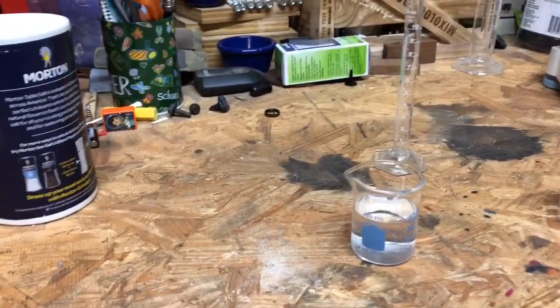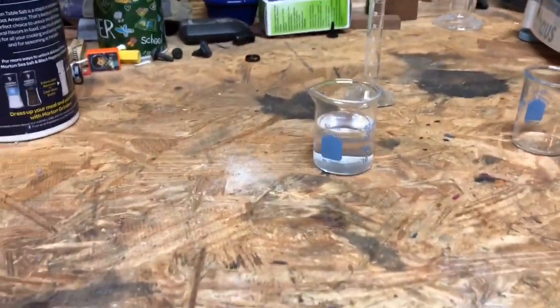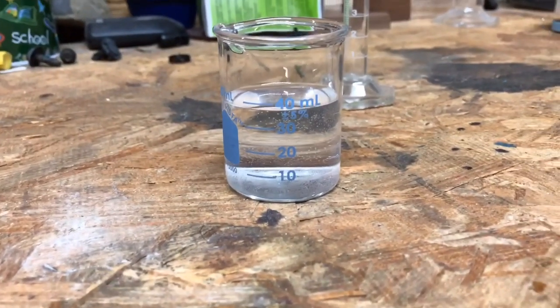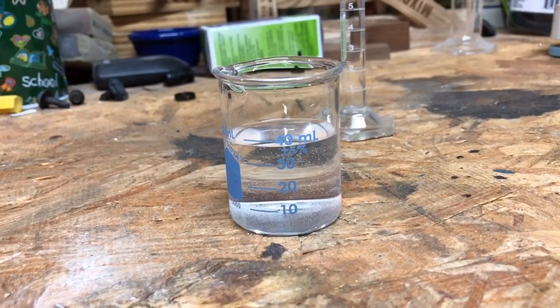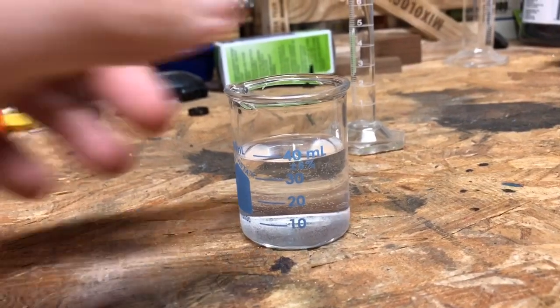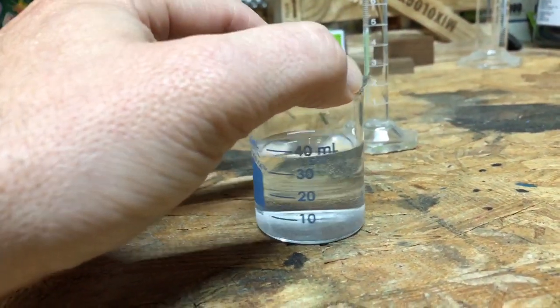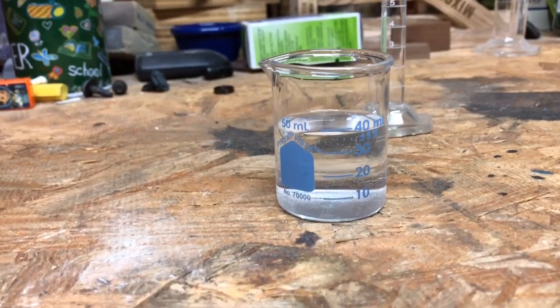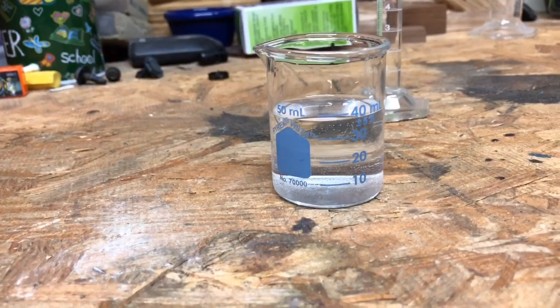And so we know that when we're trying to see how well something dissolves, you have to be working with a saturated solution. What I've done to start is I've taken a beaker, filled with some water. This amount of water probably is not the most important volume. It's going to change as we start adding to this, but we need to create a saturated solution.